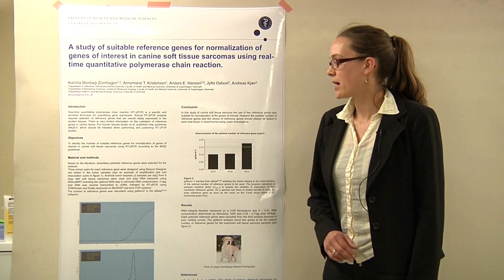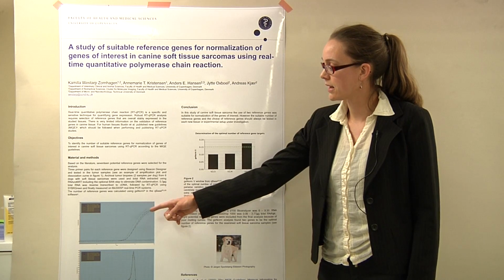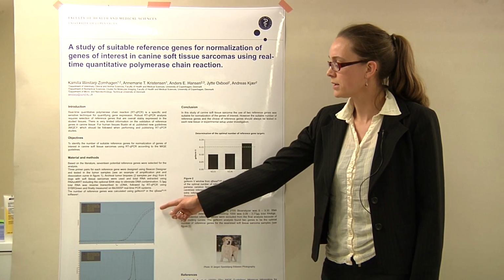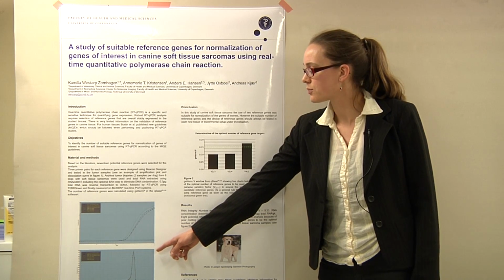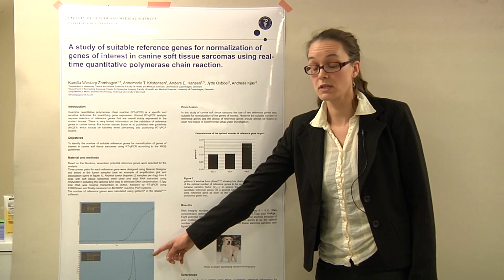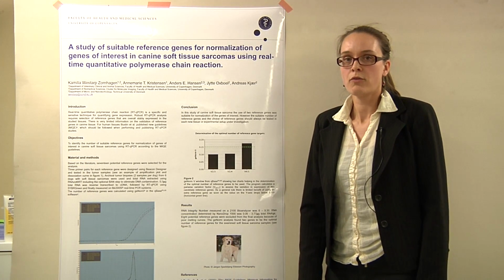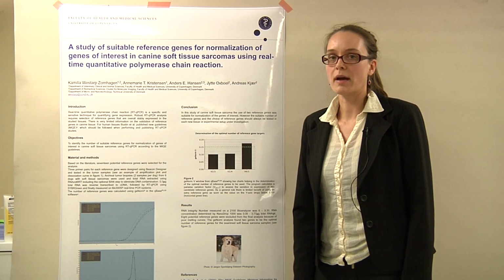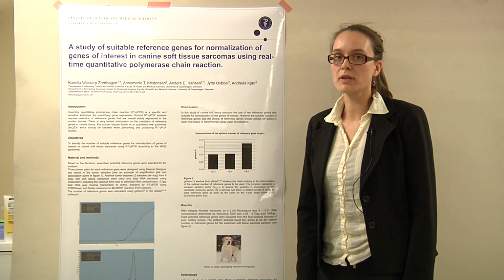The best primer pair was selected based on the amplification plot, as seen here at the top of figure 1, and the dissociation curve, which should only show one melting product to show specificity, as seen here at the bottom of figure 1.